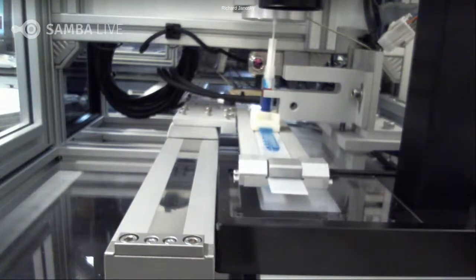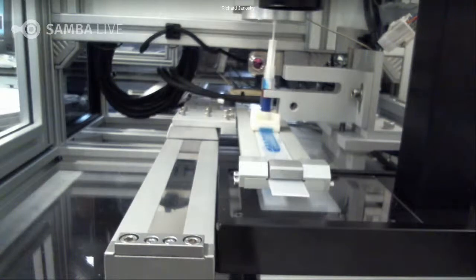So now we're going to hit our slower extrusion profile. It'll almost look like it's not moving on your video feed. It's moving very, very, very slowly. And then next, it's going to pick up its speed.